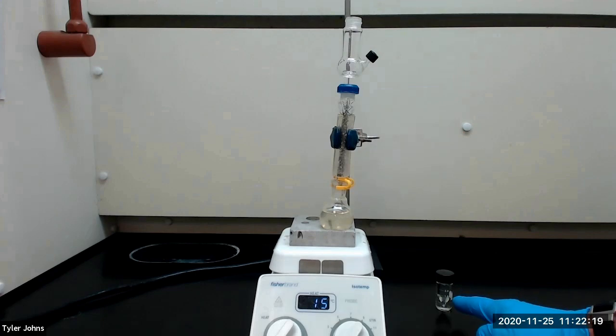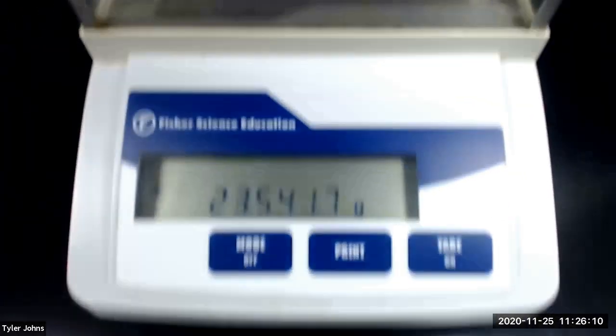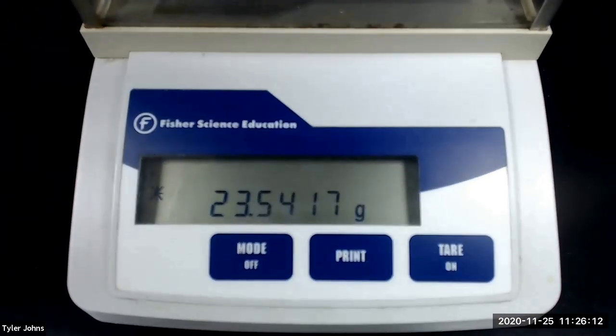We will now pre-weigh the 3 milliliter conical vial that we will use to collect our distillate. The mass of the pre-weighed 3 milliliter conical vial is 23.5417 grams.